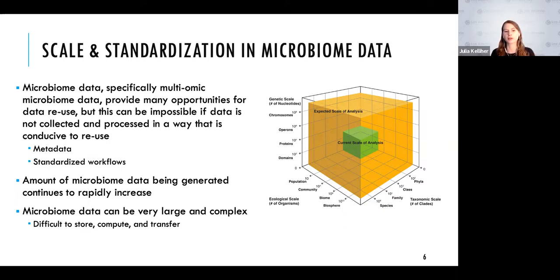And especially with multi-omic microbiome data, especially if it's not connected, you can't really tell where the metatranscriptome data came from or metaproteome data and how those can be integrated. So having effective metadata and potentially standardized workflows for this microbiome data can directly lead to that data reuse.